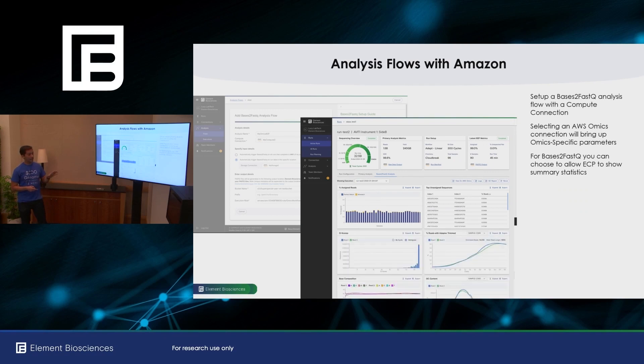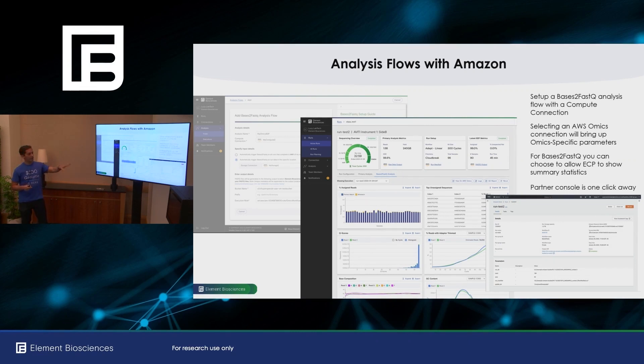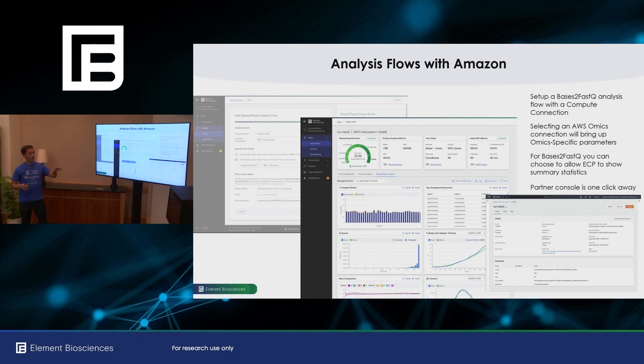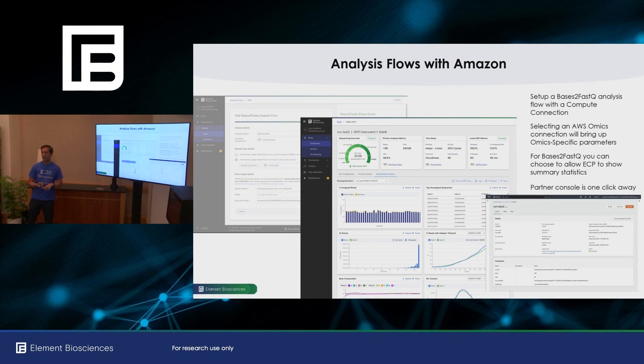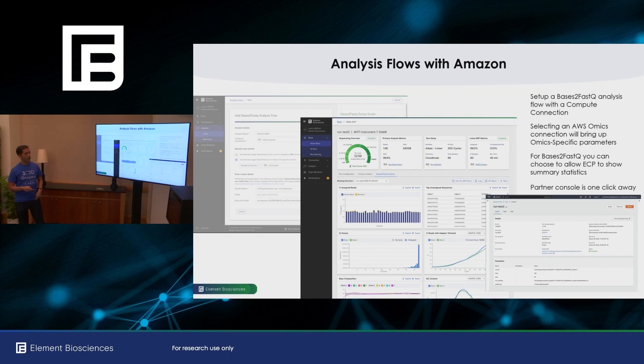And if you've configured it to allow Element BioCloud to access the summary statistics for your run, then you can view those statistics right in the Element BioCloud portal. Another really nice feature is that your information from your partner console is just one click away. So in this example is showing the AWS management console, which is where you can view logs and other data that are associated with that specific execution. Again, this is in your own AWS account, but the convenience is that you just have a single click and you can access all that information.